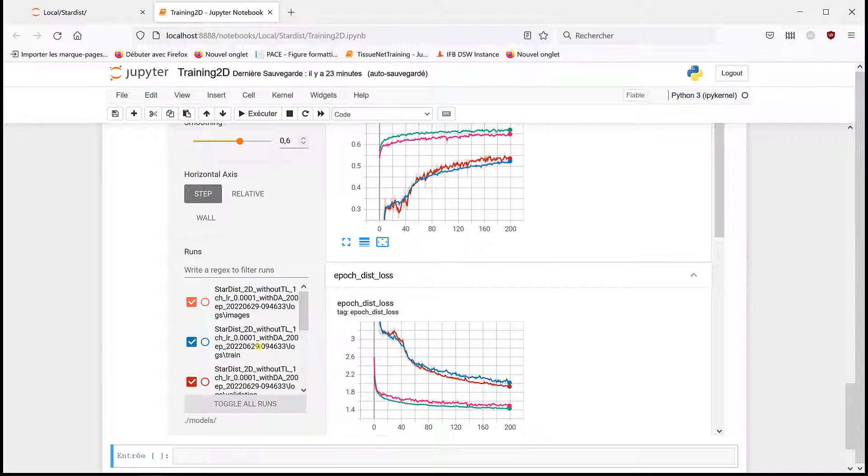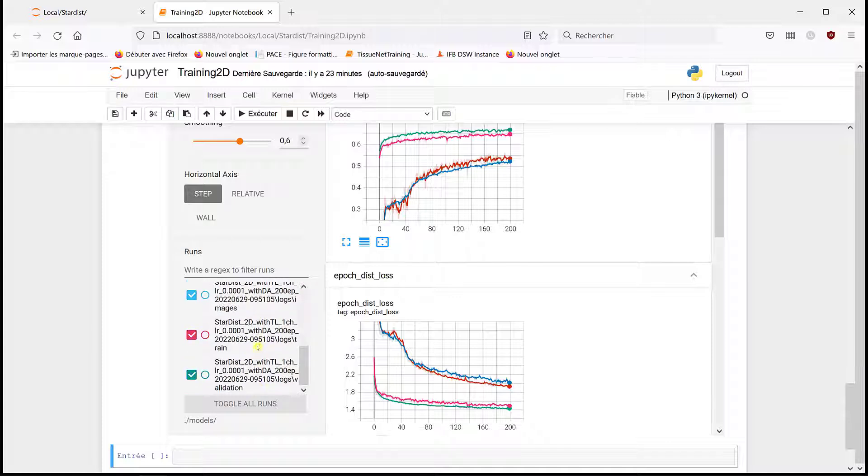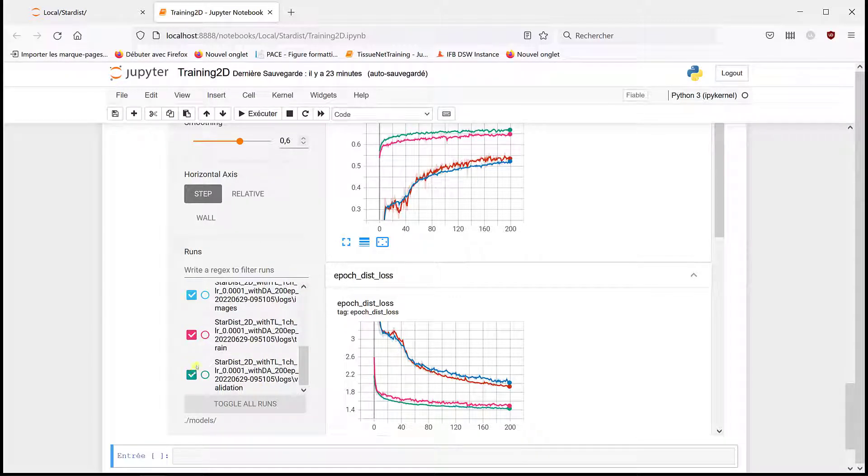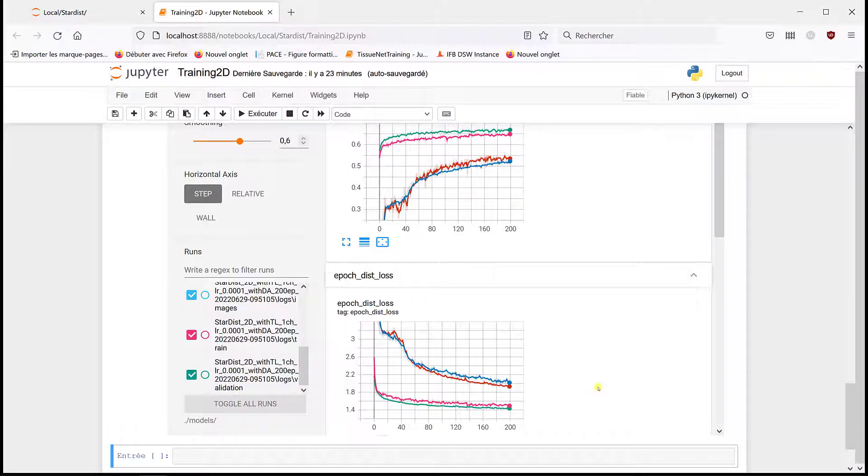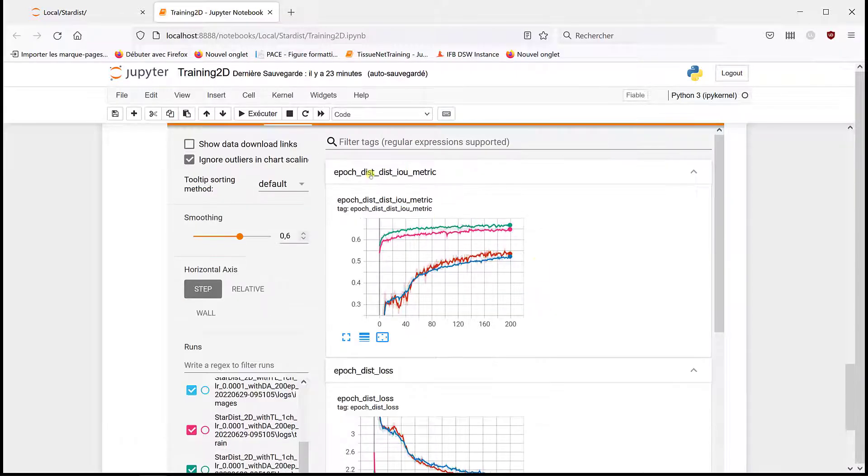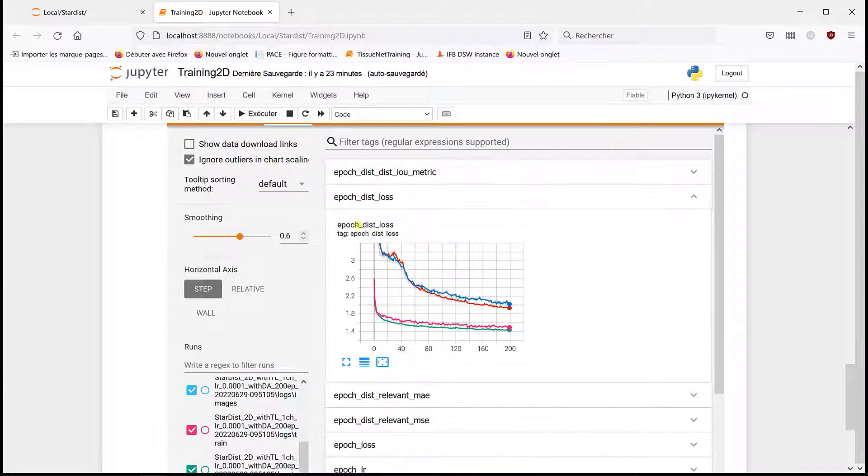And magenta and green is with transfer learning. So here we have different losses.